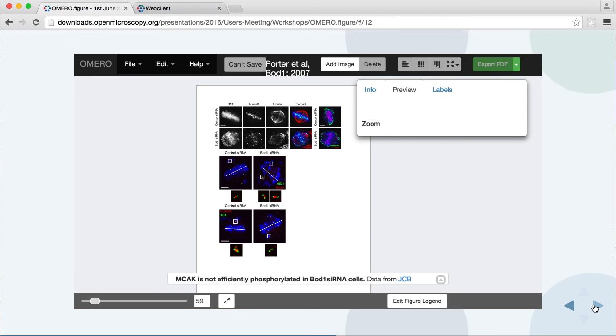Okay, so I'm going to give you a quick demo of the software. You can access this demo from the OMERO.figure website.